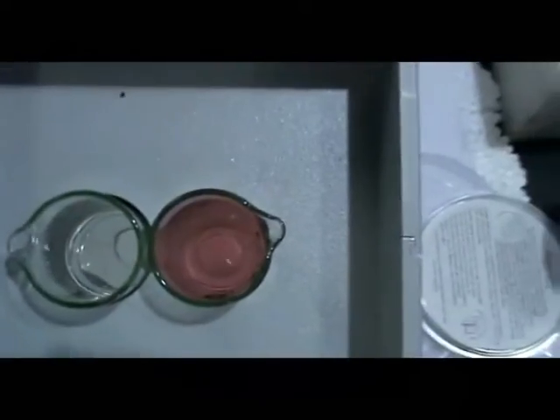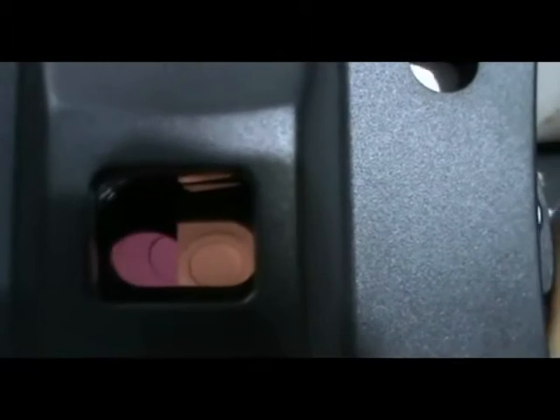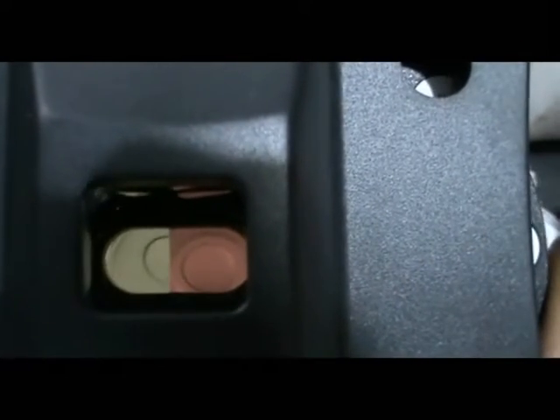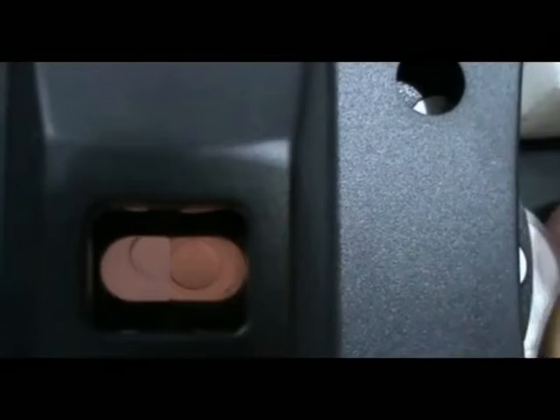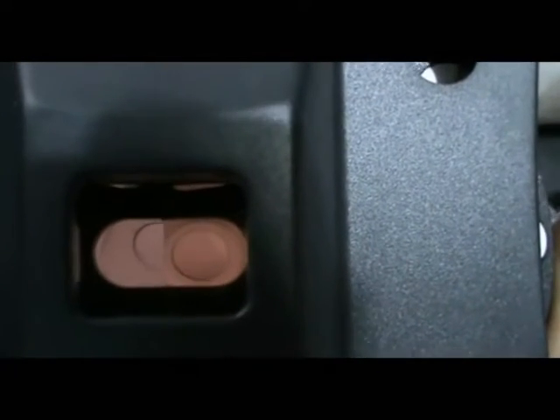Then close the cover. Rotate the disc and match the color of the sample with the disc. Once it is matched, take the reading on the disc.